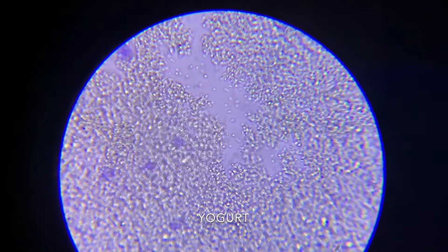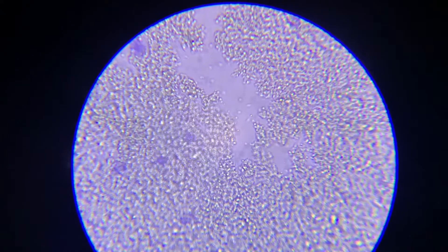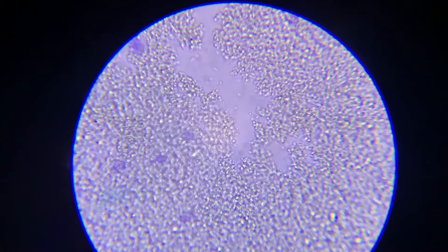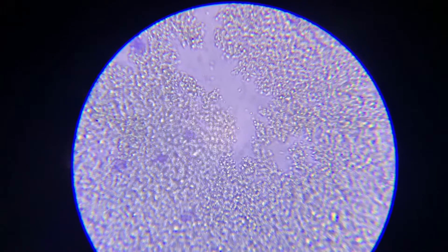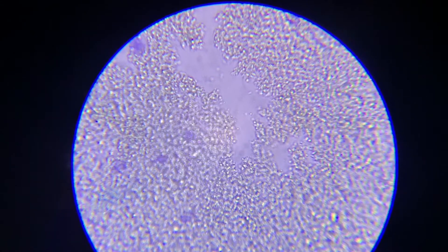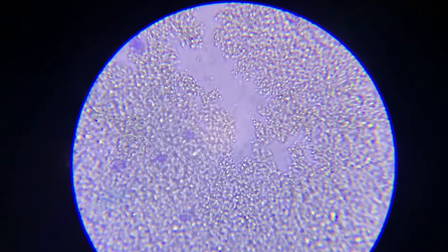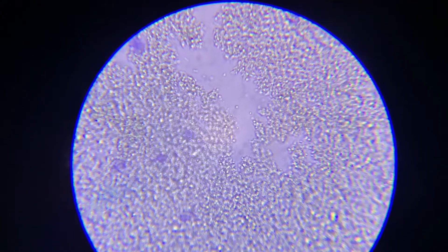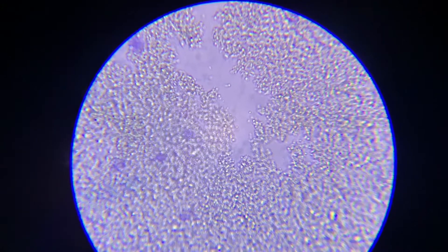Alright, what are we looking at there? You are looking at archaebacteria. They are single-celled and can live in extreme environments — more than 400 species. Extreme environments like very hot water, salty water, and they can consume other organisms or make their own food.